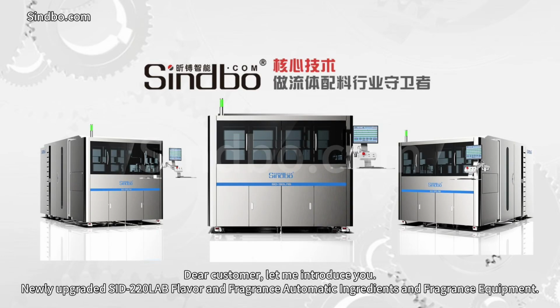Dear customer, let me introduce you. Newly upgraded SID 220 lab flavor and fragrance automatic ingredients and fragrance equipment.